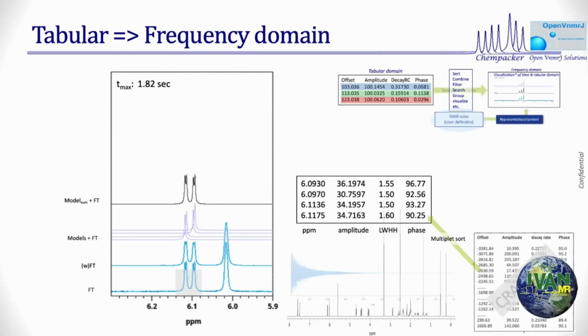I understand NMR. I want to apply NMR. I simply look at that 4 and say, that's a proton. That means it is a single magnetization split into 4 resonances. So I have these 4 resonances in the table. Combine them back. Your NMR rule says that one proton, one signal, got split into 4 simply because there is a passive spin sitting around. I simply say the opposite. I have these 4 magnetizations. I know it's a singlet. I know it's a proton. Add them together in a vector fashion. These are vectors. Just keep remembering that.